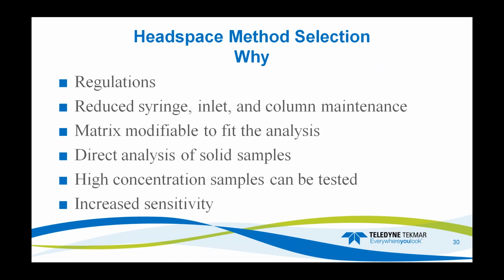The other thing that the why would be is to reduce the syringe, inlet and column maintenance. In the beverage industry, would you want to take a soda and inject it onto your GC? That cruds up the inlet very quickly and can put compounds on the column that you don't want. It may make your syringe sticky. If you have an autosampler, it may cause your plunger to jam up in the autosampler. So Headspace can reduce that.